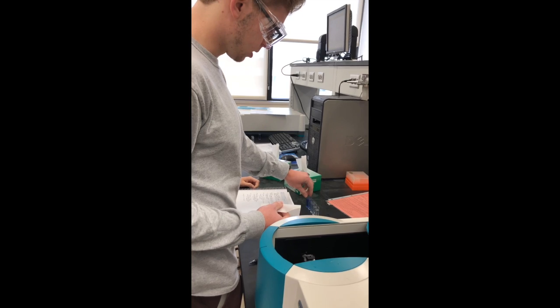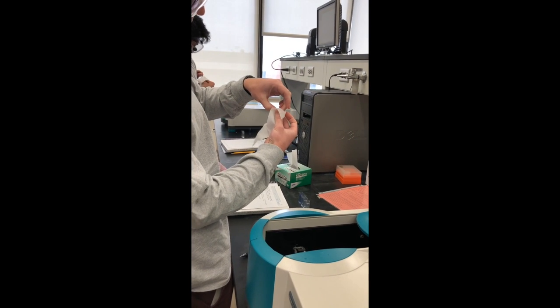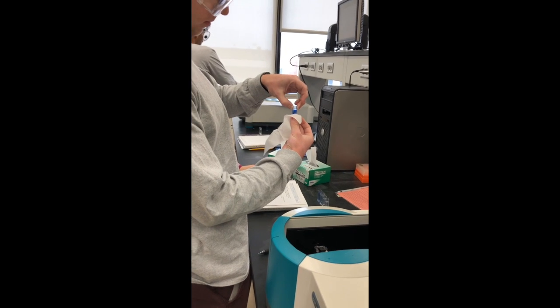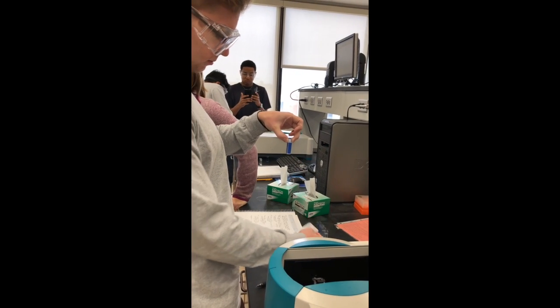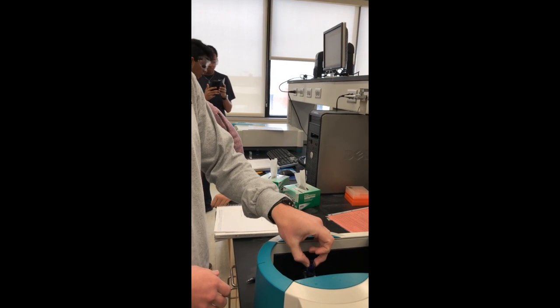After zeroing the spectrophotometer, students then clean the cuvette of the stock solution before putting it into the spectrophotometer and scanning across all wavelengths in order to find the lambda max, which will then be used in a different program to more accurately and quickly measure the absorbance of each dilution of the stock solution.